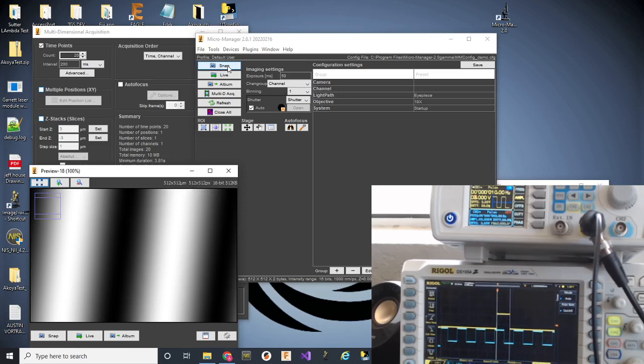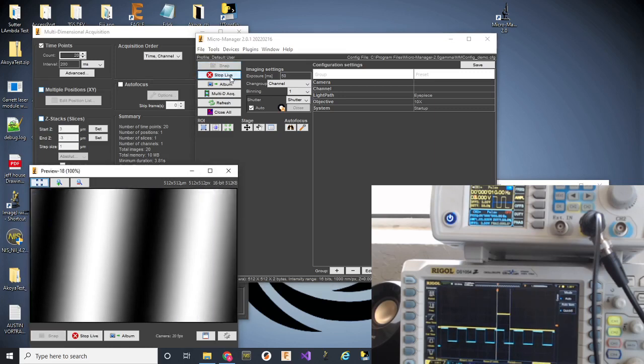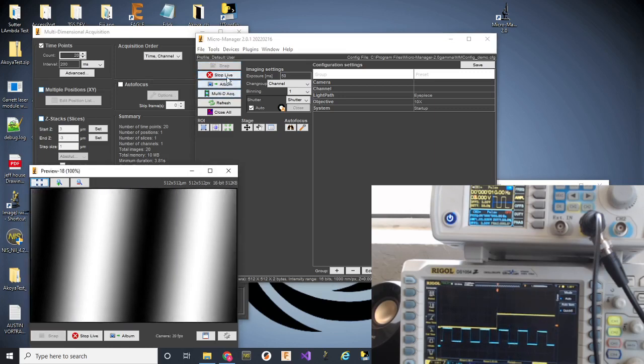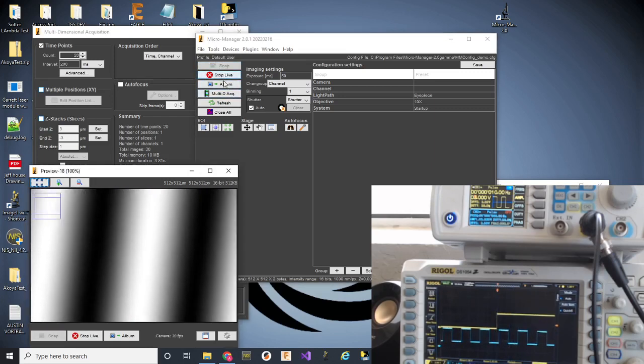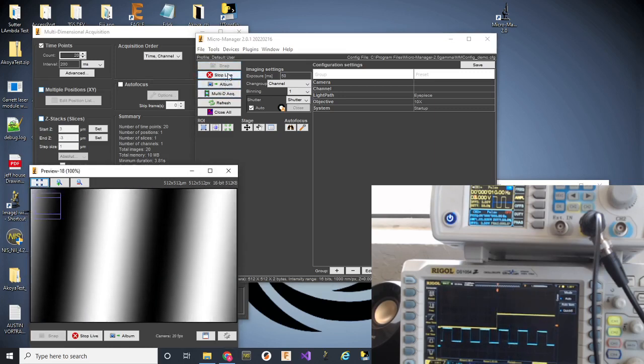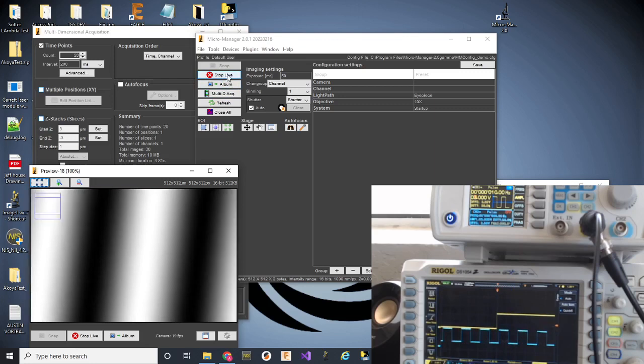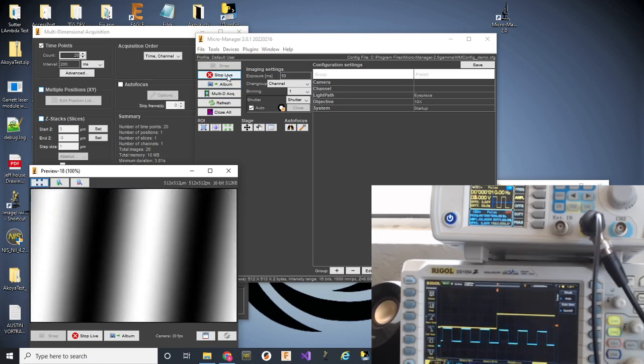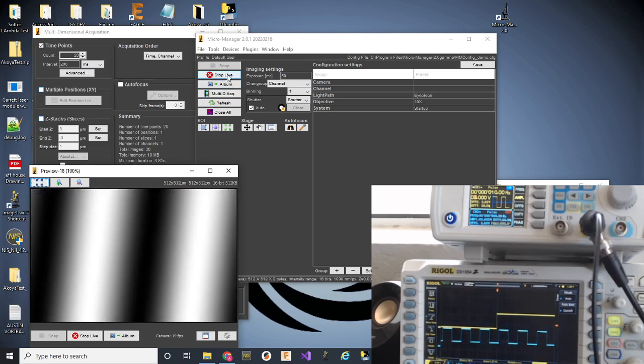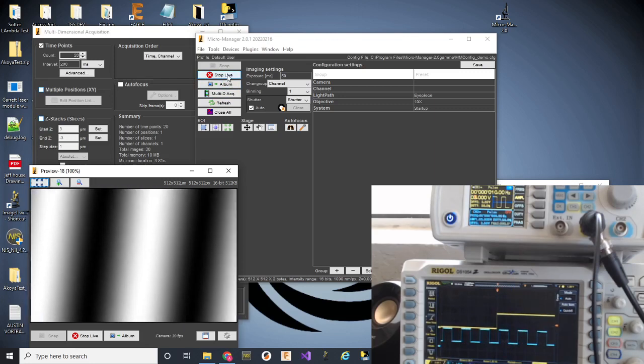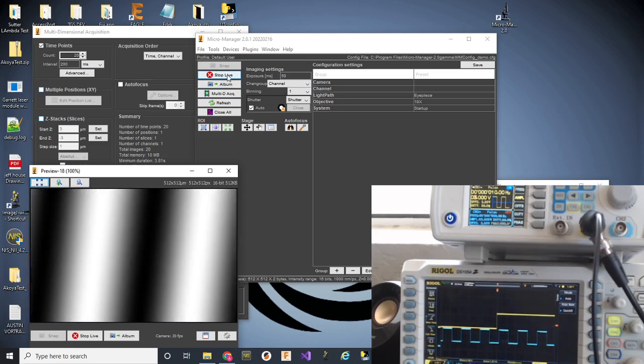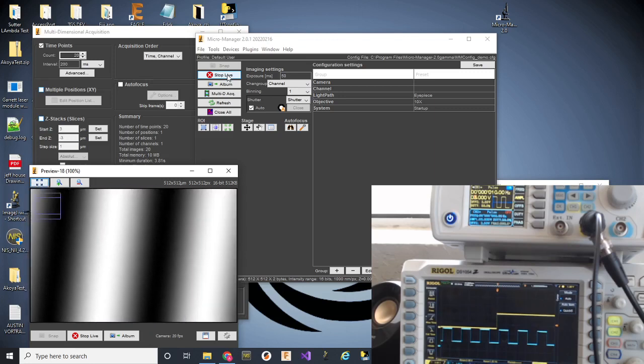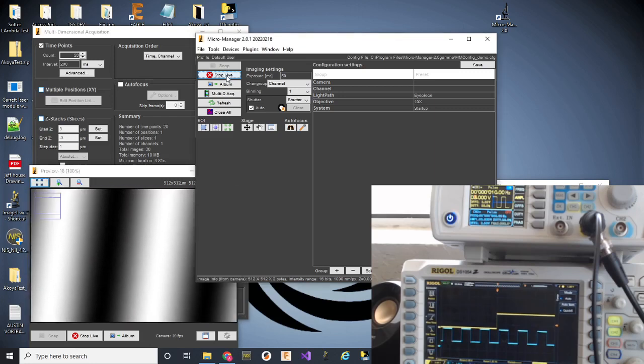How do we turn on blanking? And just to show this, I'll go live. This is just the TTL1 is now on infinitely. And you can see that there's no interaction with whatever is happening on that blue line.